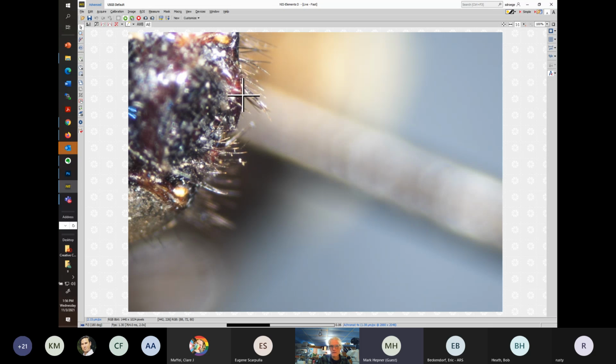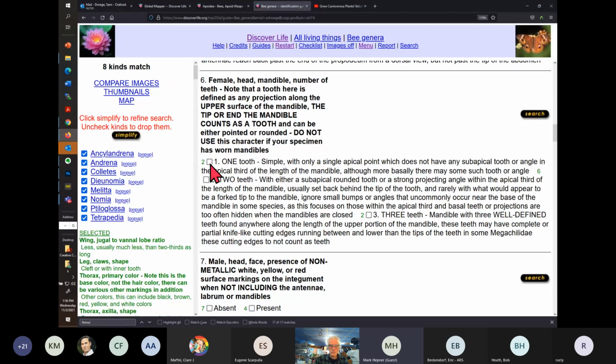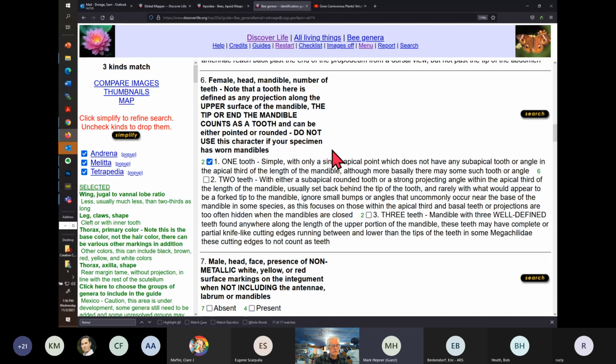Are we running out of time, Claire? No, I was just, that's really hard to see. Yeah. I'm going to say, again, based on time, I'm going to say one tooth, which would be nice. He's only got a couple there. Let's see if that's true. And there's 3 there now.